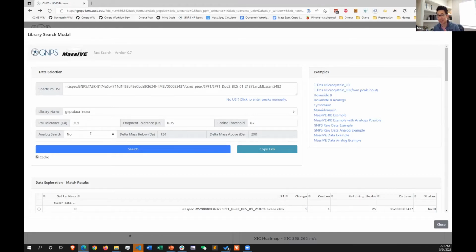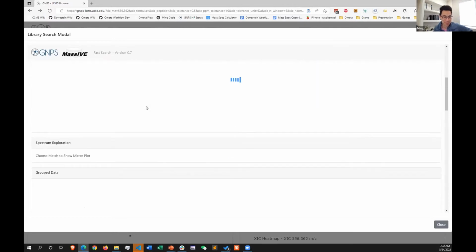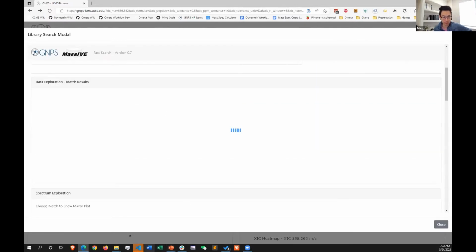And so I think it's kind of cool, especially if you're looking for metabolism products or shunt products for biosynthesis and things like that, or chemical degradation. So we turn that on. And here these are the bounds for mass delta. And we click search. And this should also be relatively quick, but just not quite as quick as the exact mass searches. So I actually haven't run this, it just popped into my mind. So, fingers crossed. We'll wait a little bit while this churns.